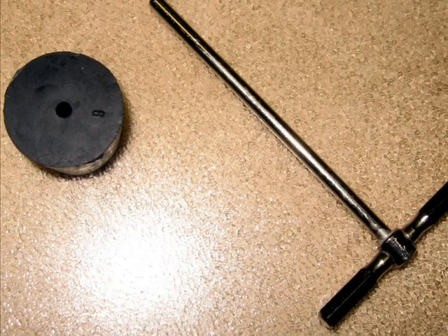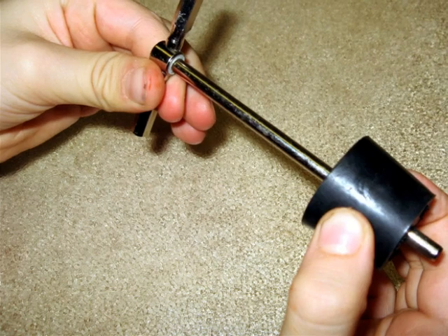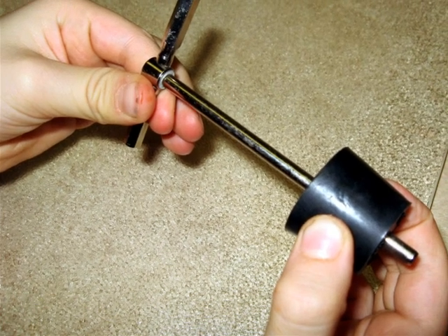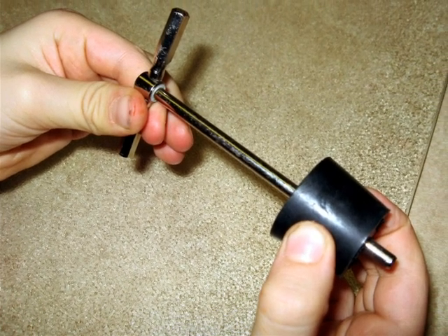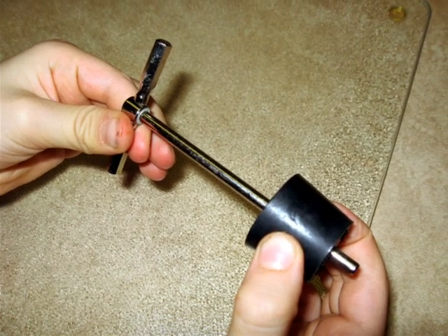To make your stopper glass tube assembly, you'll first want to enlarge the hole in your stopper using a cork borer. You will want the hole in your stopper to be as wide as the outside diameter of the bent glass tube that you will be using.